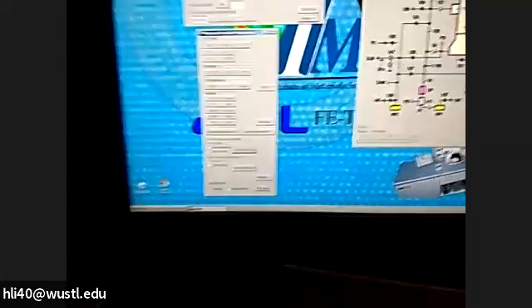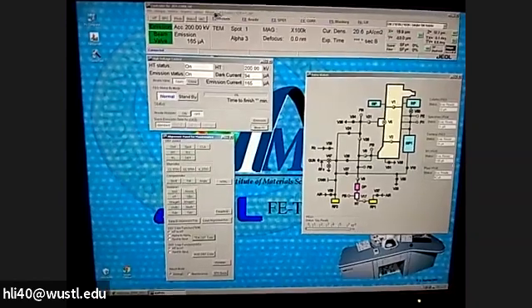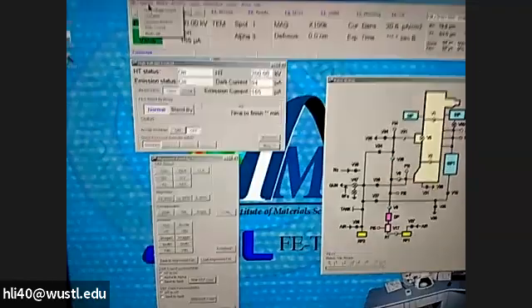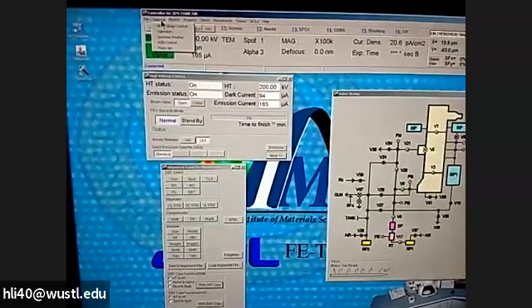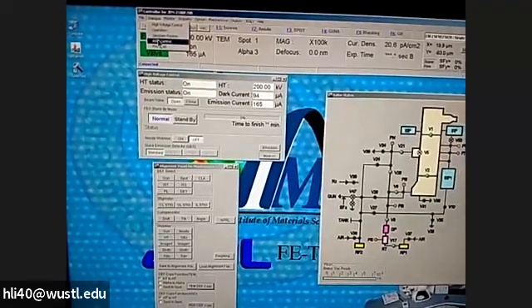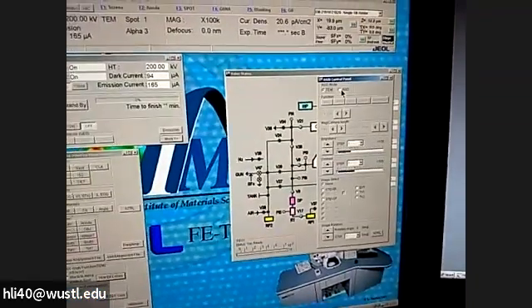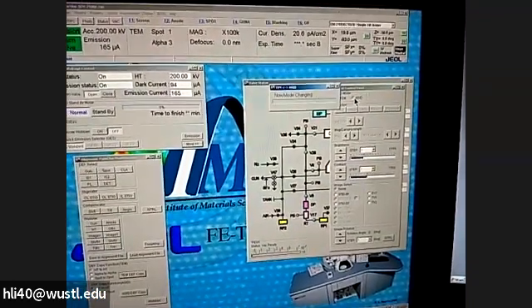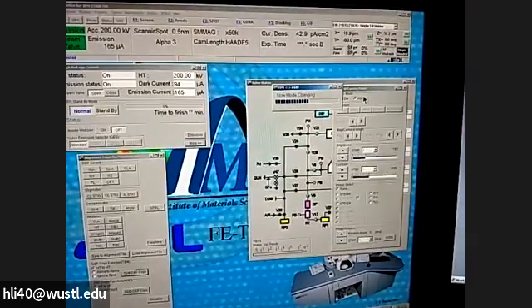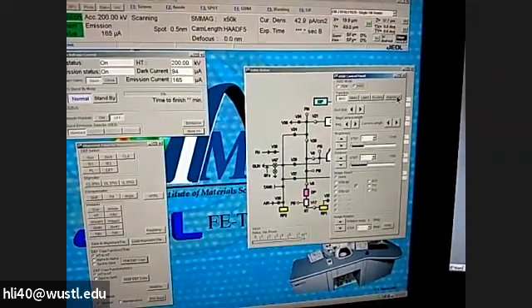The next steps are mostly just a software application. We go to the DAG log box, select ASID control, and just click ASID. You will then change mode to the STEM mode. After that, you click alignment.